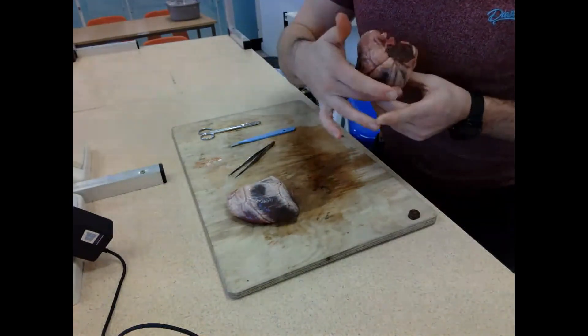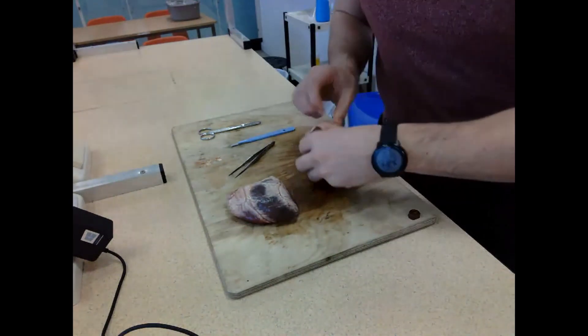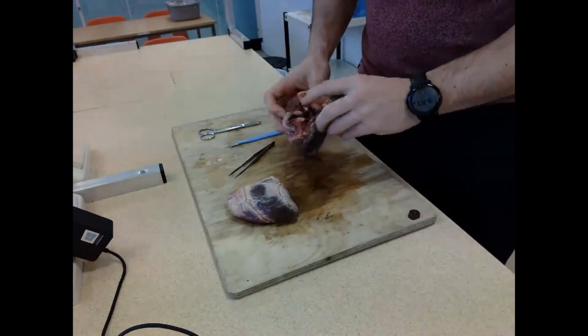I'm placing the heart flat down to make it easier to cut. If you look at your body, the left hand side is on your left and the right side is on your right, but when you place it on the board to cut, those get inverted - just as we know from when we're drawing our diagrams.